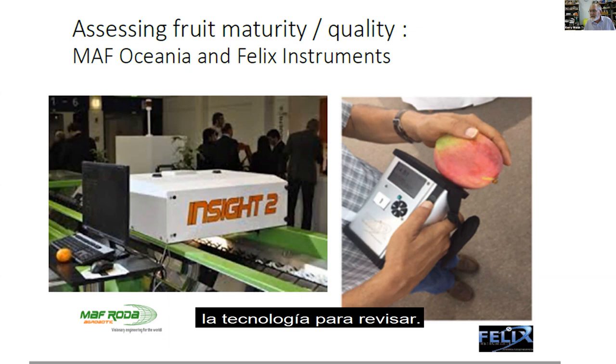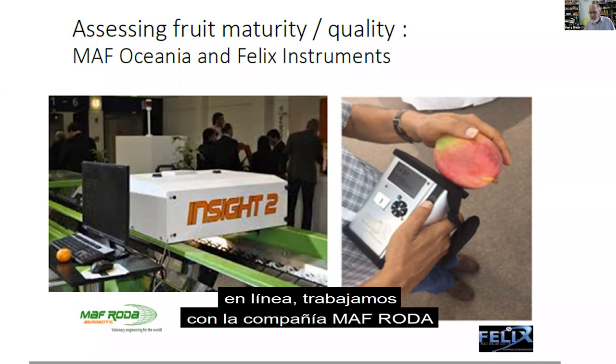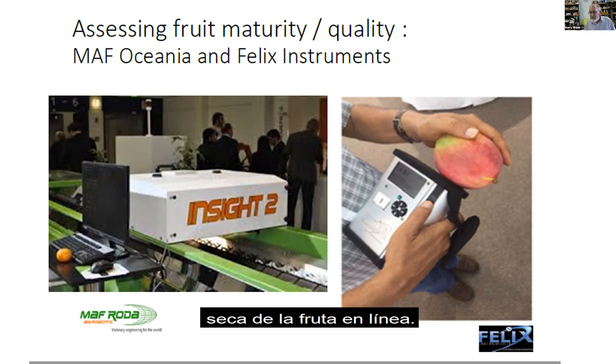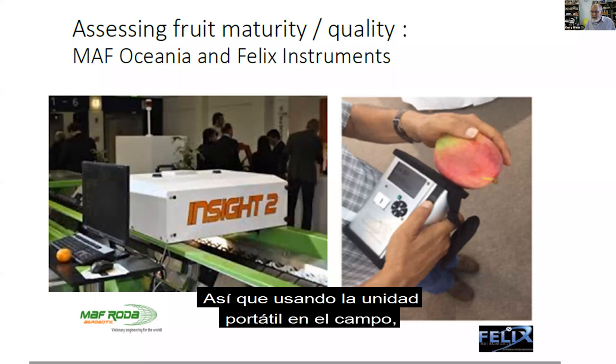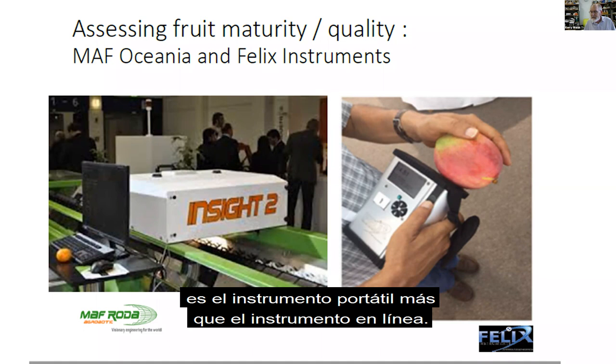This slide is just to illustrate we have also worked in terms of implementation online. We worked with a company, MAF Roda or MAF Oceania, and we can check for dry matter content of the fruit online. The problem being is it's too late, because by the time you've harvested it, you've destroyed your options. So by using the handheld unit in the field, you have a management option left to you. You can leave the fruit on the tree longer, you can change agronomic conditions, water applications, etc., to modify the dry matter of the fruit. So the preference in the Australian industry is the handheld instrument rather than the inline instrument.